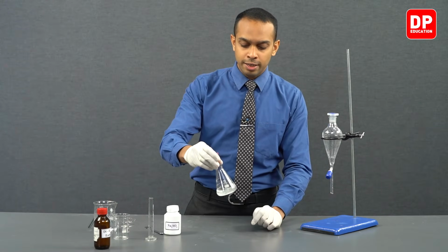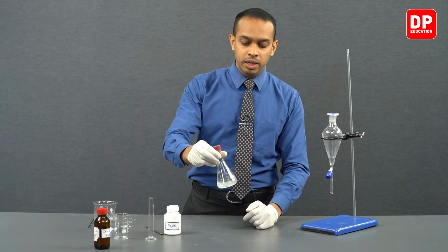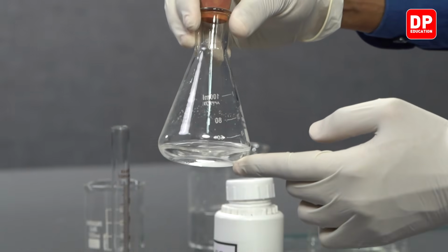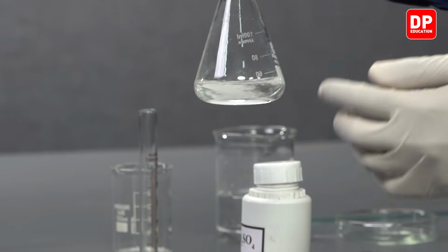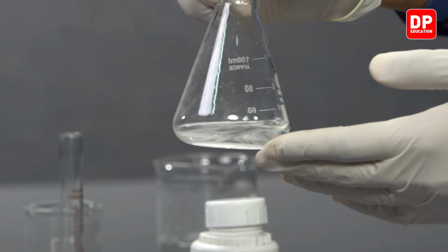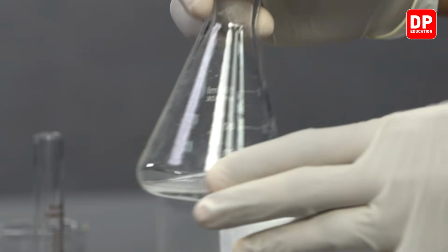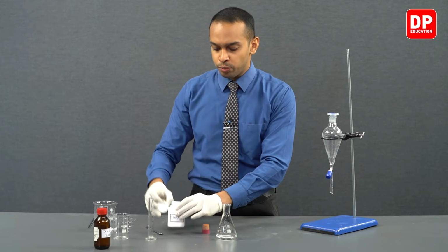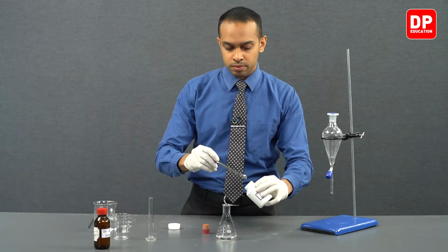Now students, as you can see, when we are swirling this around, we can't see the sodium sulfate clumping together. This is indicating that we do not have excess water present in the medium, but just to be sure, we can add a few more scoops of sodium sulfate.